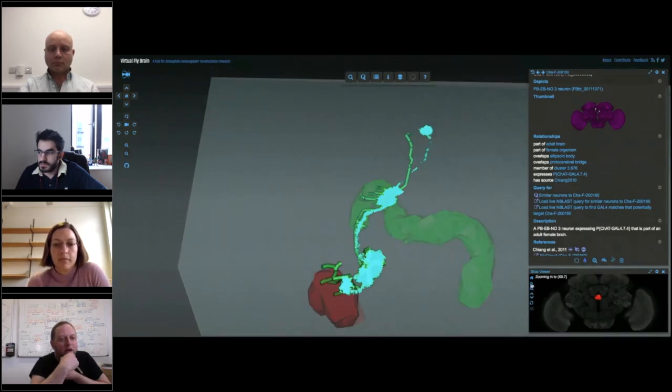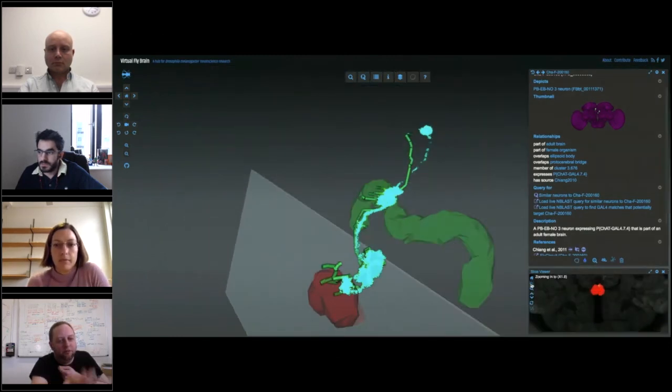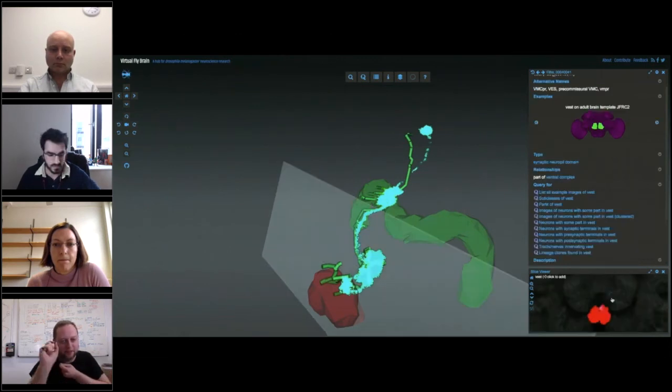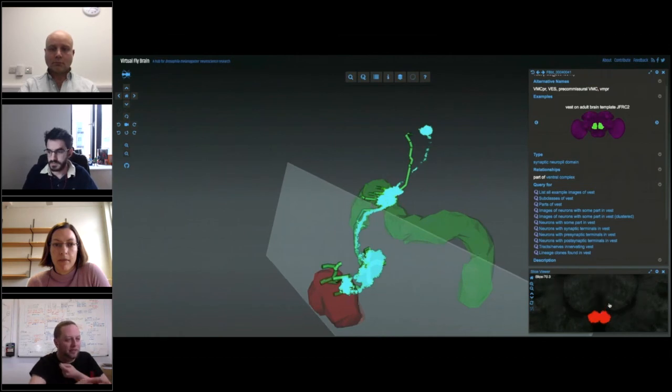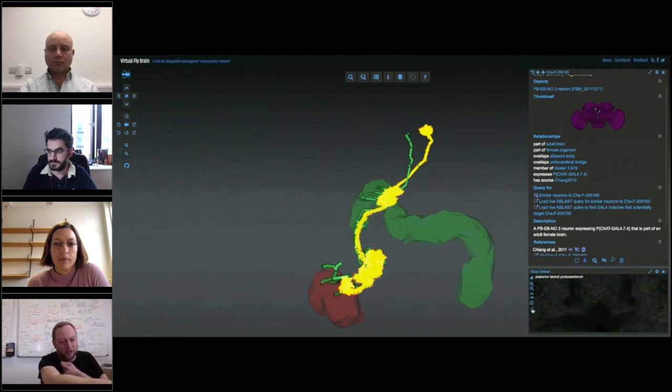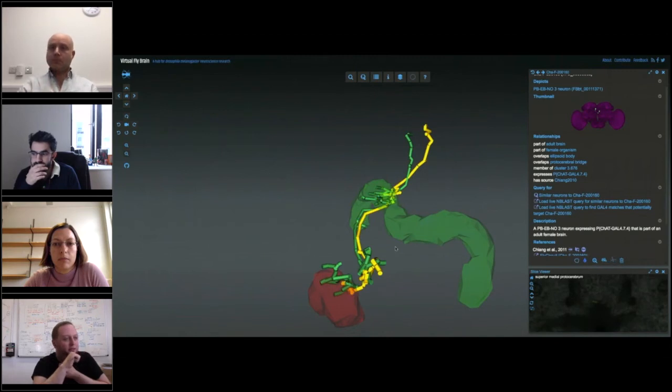A lot of these show why it's quite important to have 3D views on neurons. In the slice viewer, it's just a single point, whereas in 3D, you can see the full structure. In the old days, you just had to slide back and forth to try and get an idea of the morphology, whereas now you can simply select it. And again, we can select any neuron in the 2D slice and change how it's displayed.